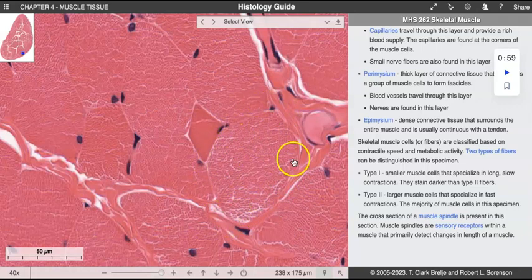And so the material inside of here, I get this confusion, like, is this the cell? Because it's like all of these tubes inside of tubes inside of tubes, and that can be confusing. But look at the magnification. We are at the 40x, right? We are really in there.